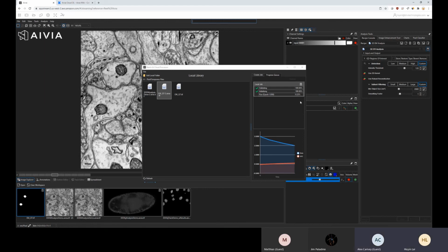Okay. So restoration is something I want to do between STED and confocal, but right now the data set I have is not big enough. I do want to acquire more in order to make it worth spending time on it. But yeah, I would definitely get in touch with you guys through Trevor in maybe a month or so. Yeah, sounds good.